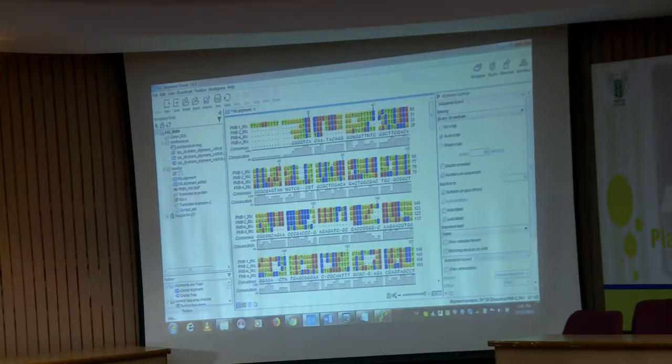So, whenever you are designing the primers, you consider what actual sequence you want, you always design the primers 200 base pairs more than the region whatever you required, correct. So, what I will do, I will just select the sequence, suppose here to here I selected, okay.